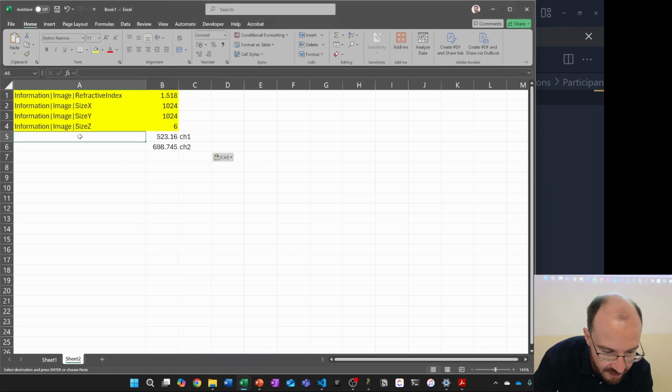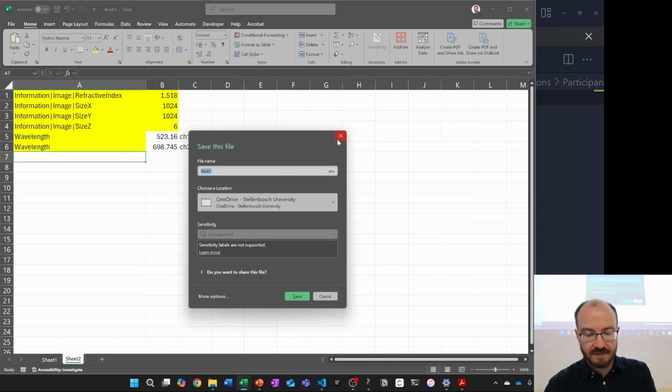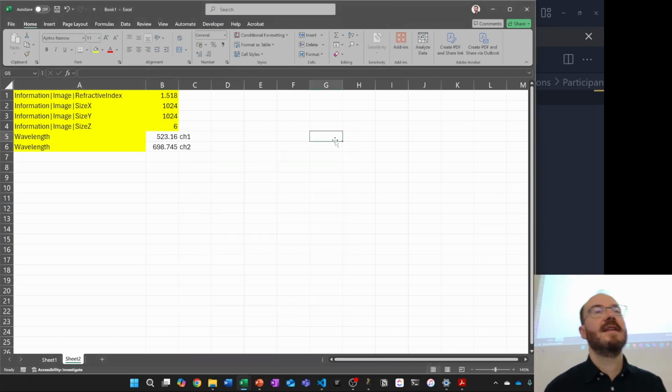Based values. So this is the wavelength. So we've got two numbers of wavelength on the Excel spreadsheet. Yeah. For the PSF generator, it's only one option. Yes. Okay.